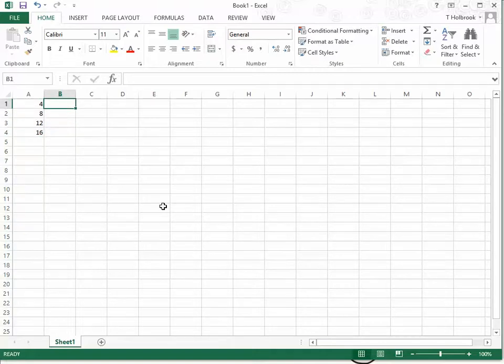And then we made a density measurement for each one of them. So I can go in and put the density measurements in. Let's say I got 0.5 for my 4%. Let's say I got 1 for my 8%, 1.5 for my 12%, and 2.0 for my 16%. I key in those numbers.